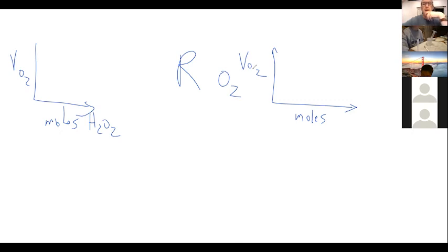What do I have to plot? Volume of oxygen versus moles of what? I know you know this.